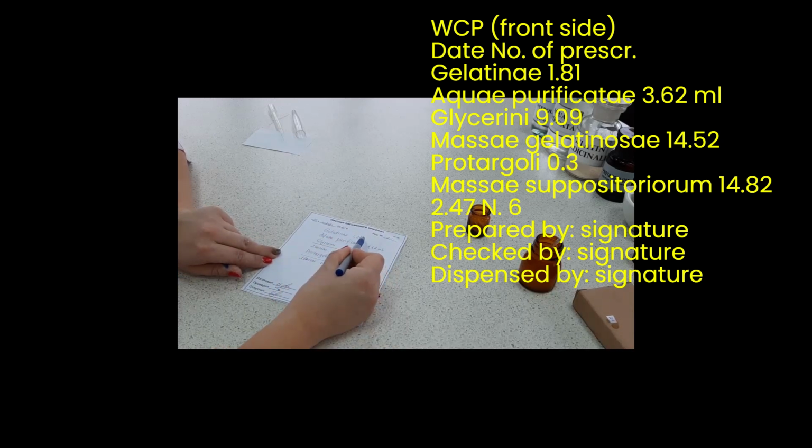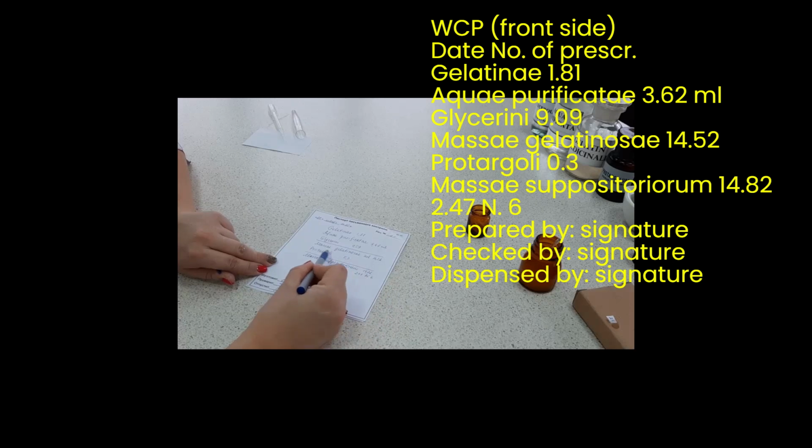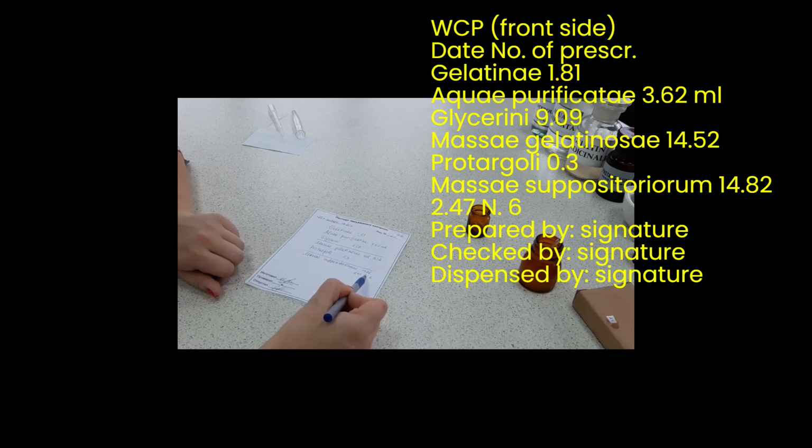Indicate the date and prescription number, the ingredients of the gelatin-glycerol base, the total amount of the base received, the amount of protargol, the total mass of suppositories, the mass of one suppository, and the number of suppositories produced.